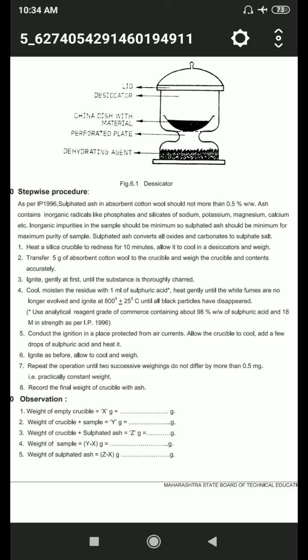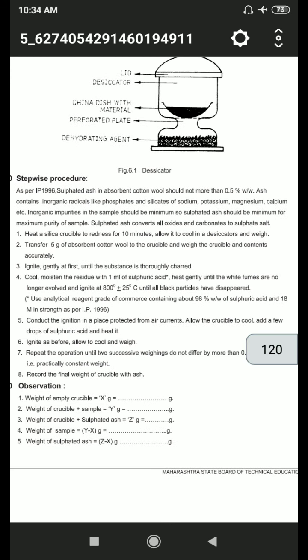Use analytical reagent grade sulfuric acid containing about 98% weight by weight, as per IP 1996. Conduct the ignition in a place protected from air currents. Then allow the crucible to cool, add a few drops of sulfuric acid and heat it, then ignite as before. Allow to cool and weigh. Repeat the operation until two successive weighings do not differ by more than 0.5 mg, that is, until constant weight is achieved.